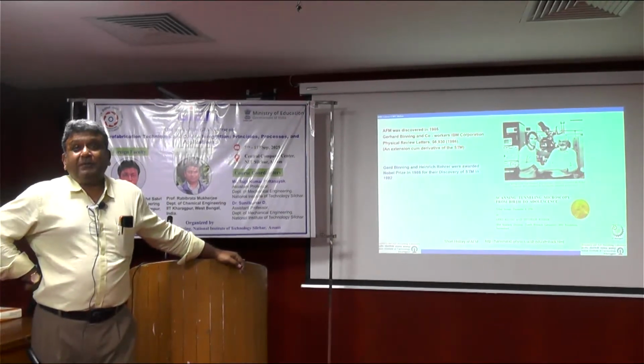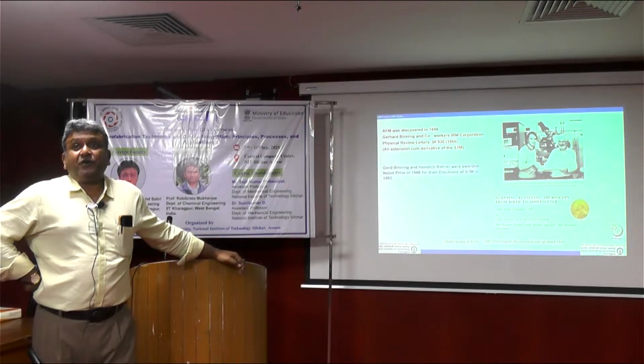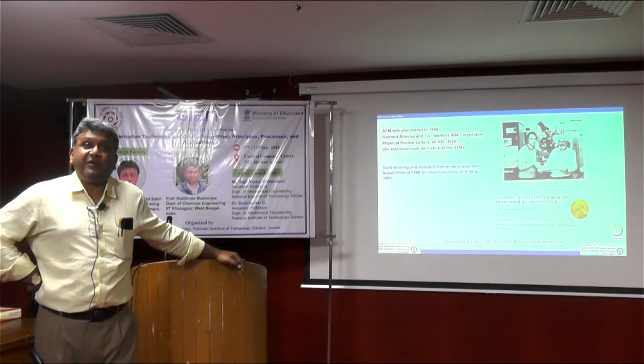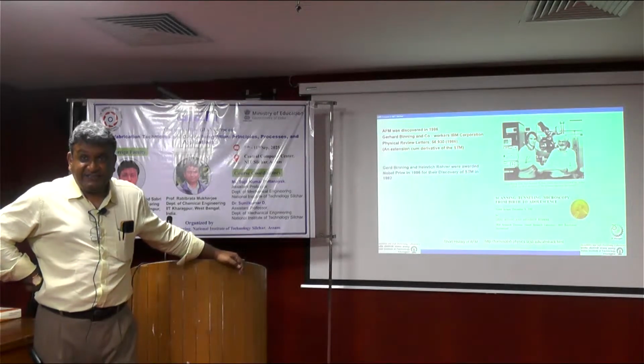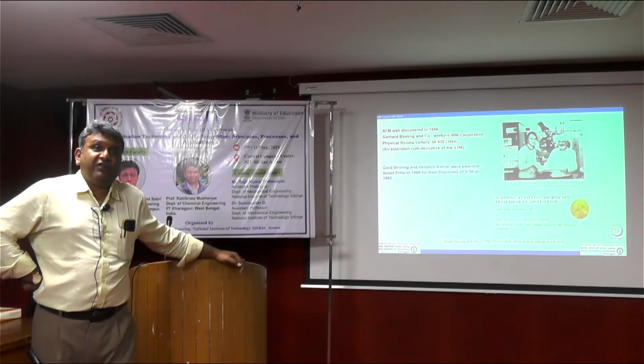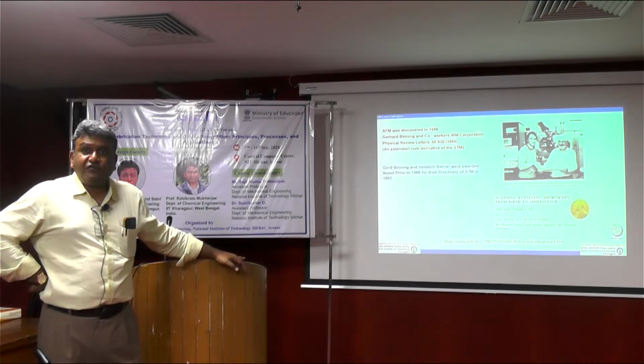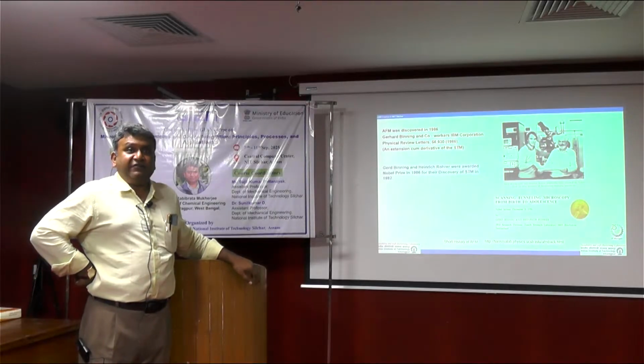However, these two people, instead of celebrating and giving parties, realized what is the limitation of the scanning tunneling microscope, started working harder, and came up with the concept of the atomic force microscope in 1986, which, as you will soon realize from what is going to come up, is far more generic, right? And it has revolutionized the world in a different way.